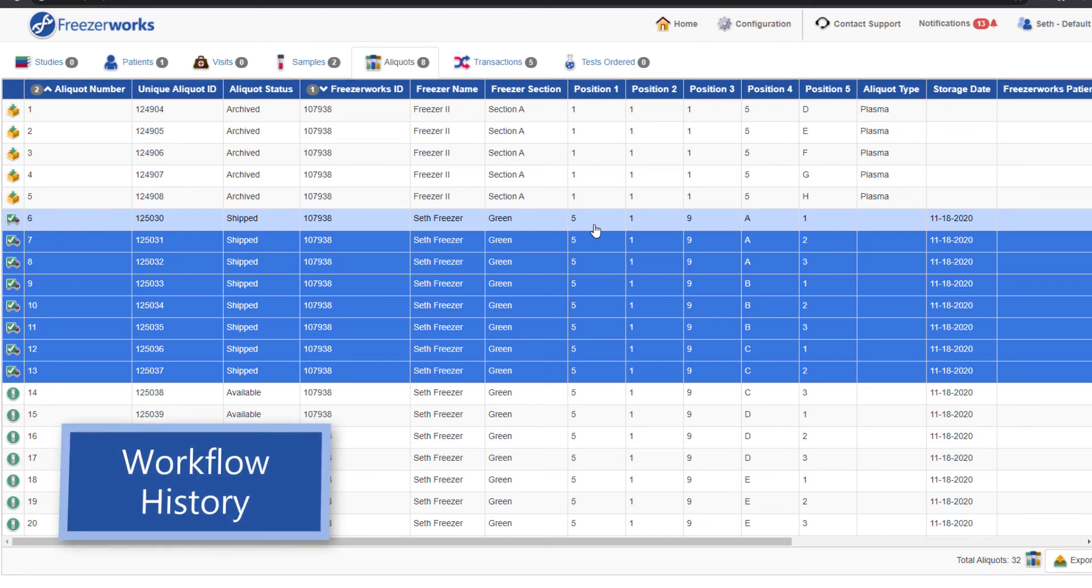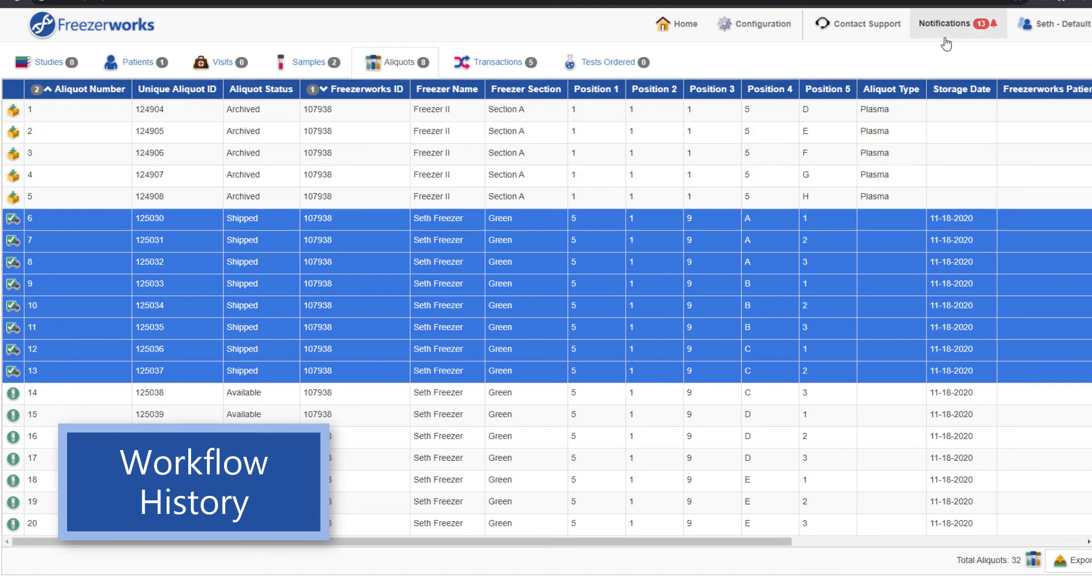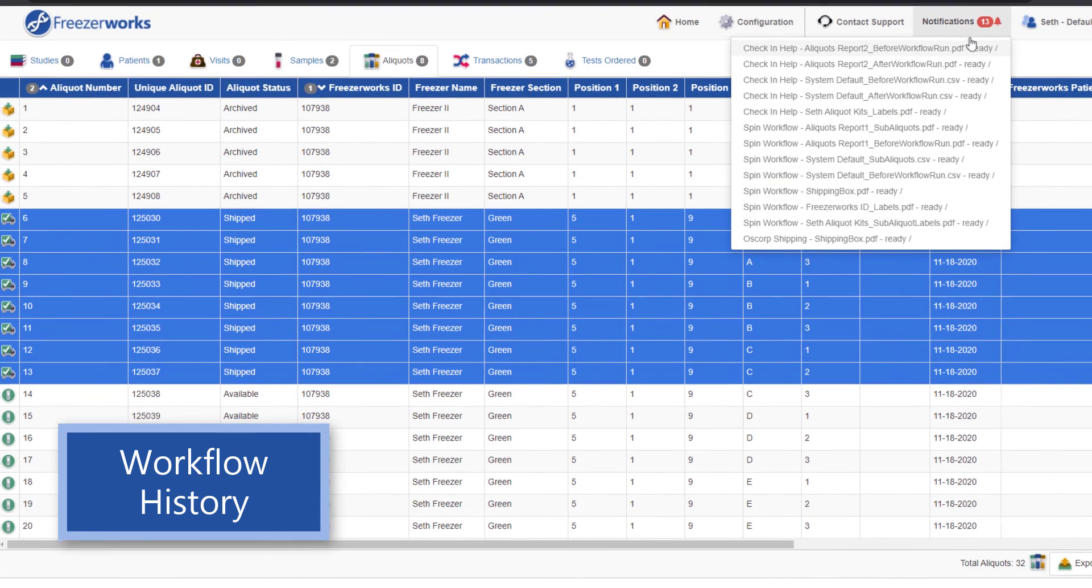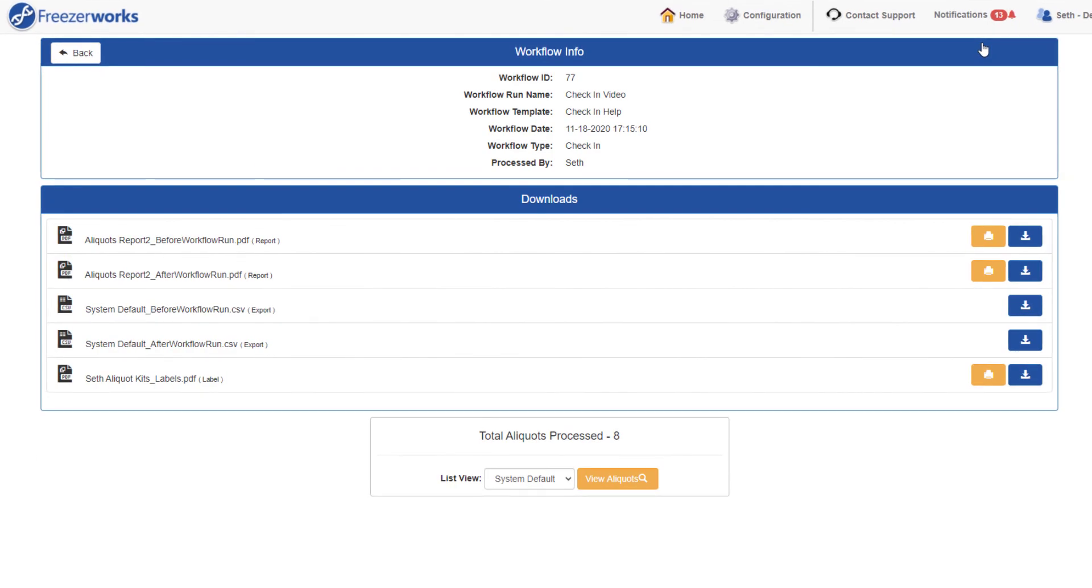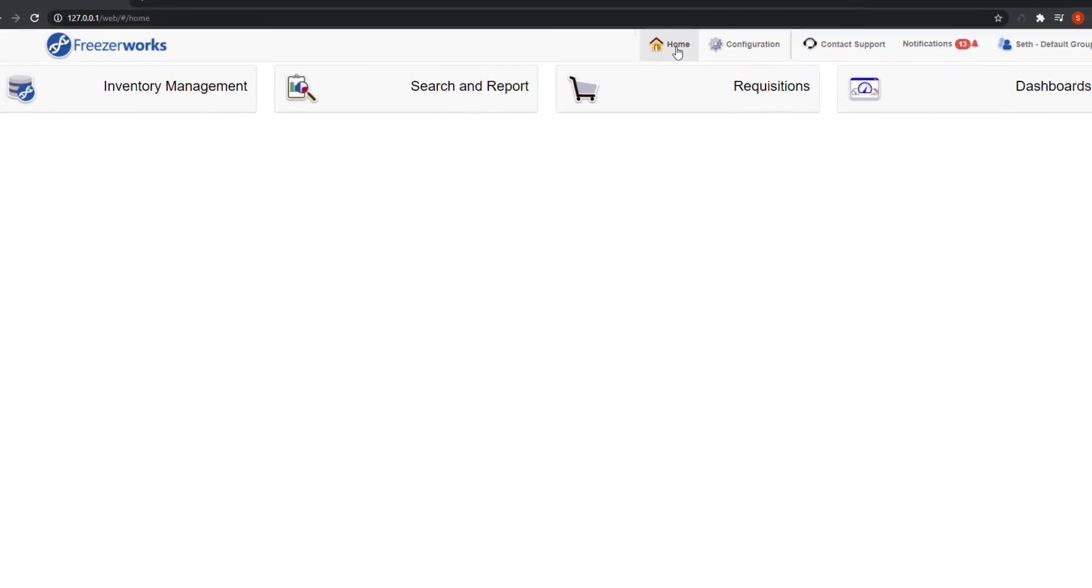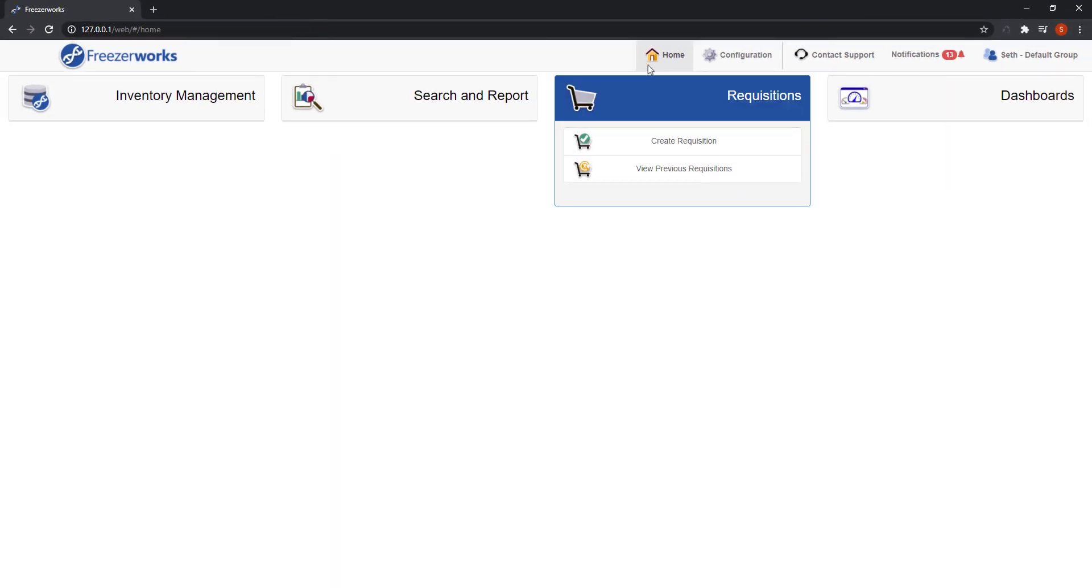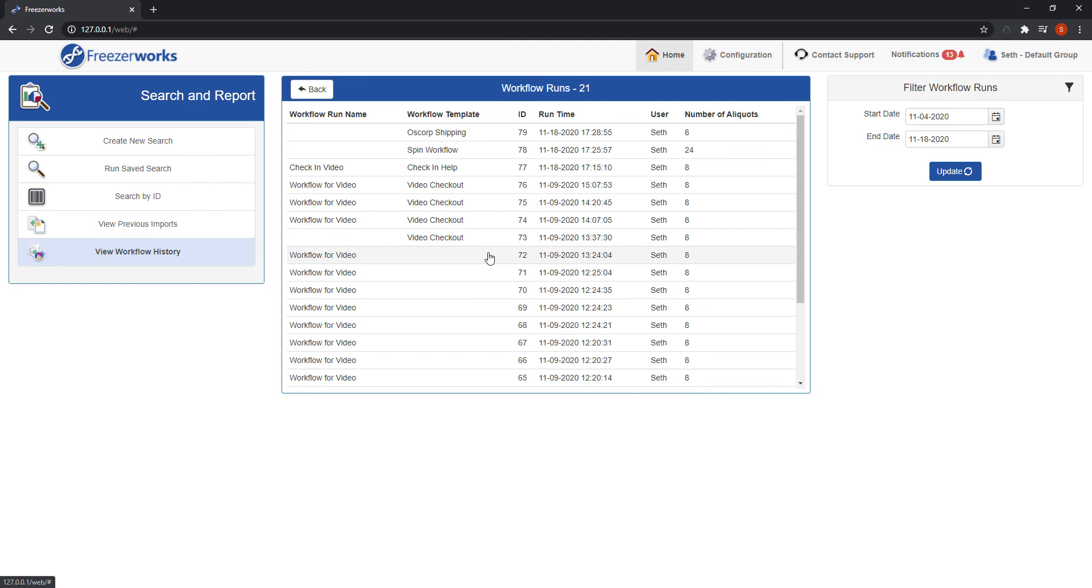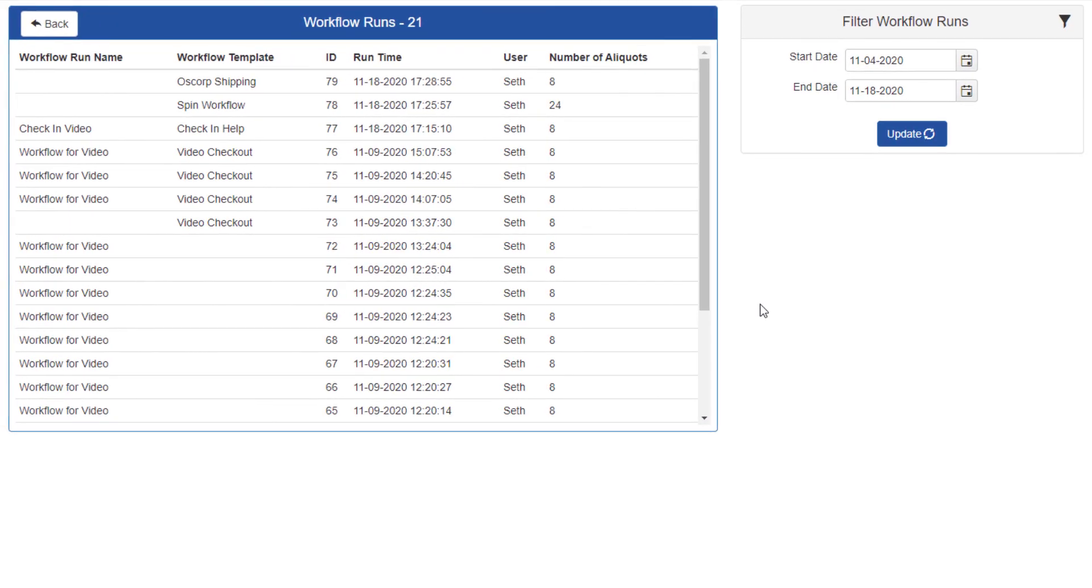Now before we finish up, let's quickly look at workflow history. A workflow history record is what opens when you select a deliverable in the notifications menu. But you can access every workflow history record in your database another way. On the home screen, hover over search and report and select view workflow history.